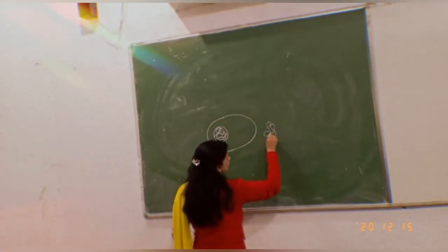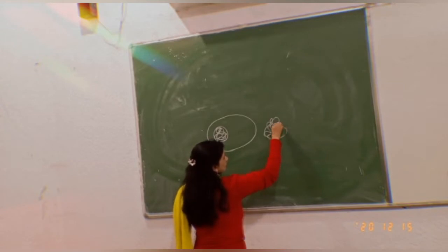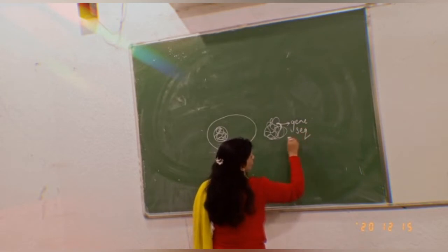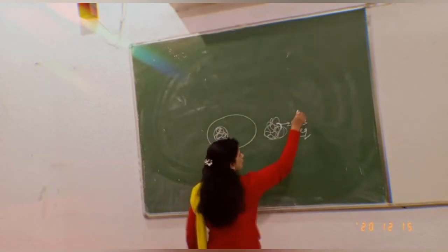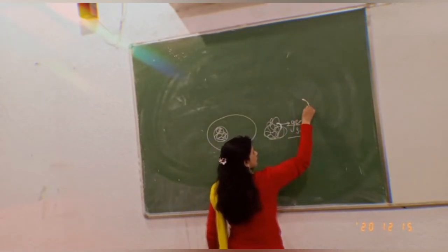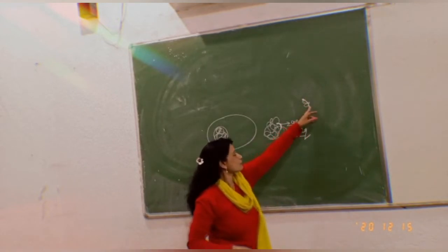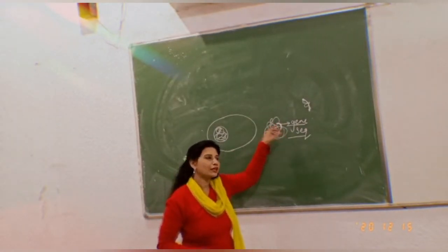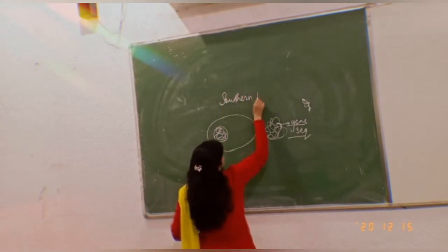Now, in this DNA content, there is a particular gene sequence which I know is there, but how do I get it? How do I understand whether this target sequence is present in this genomic content or not? That I have to analyze, and I will do it with the help of this method, that is Southern blot.